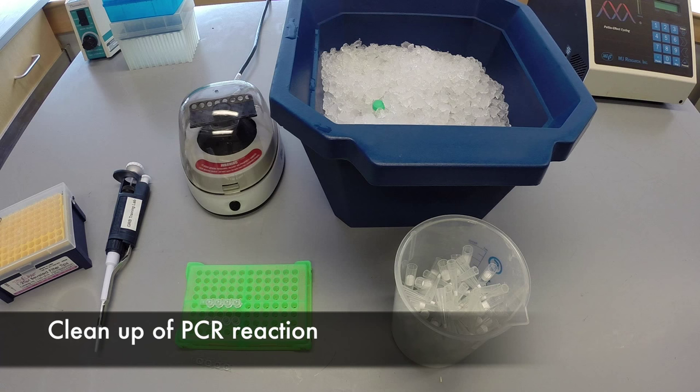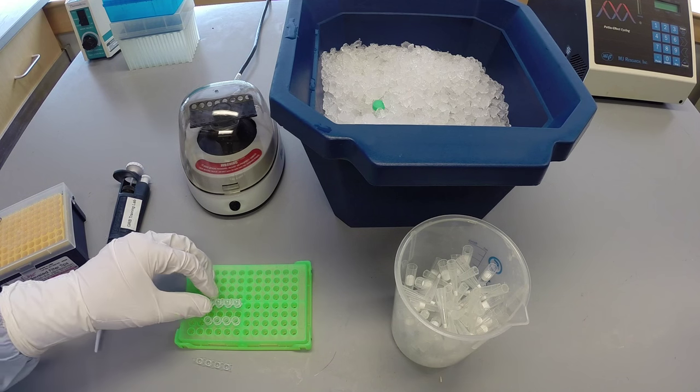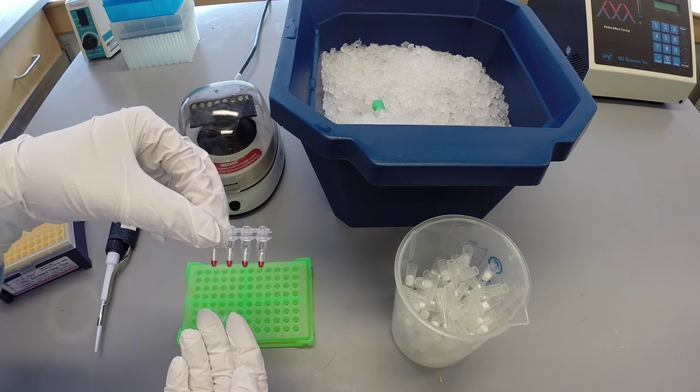In order to prepare amplified samples for sequencing, they must be cleaned up. The amplified samples have tons of excess nucleotides and primers from the PCR reaction and need to be removed so that they do not interfere with the sequencing reaction.